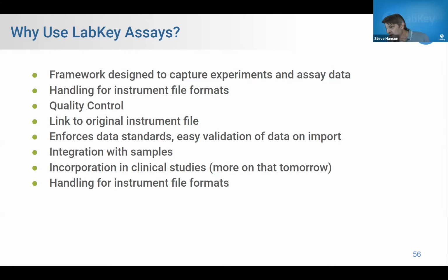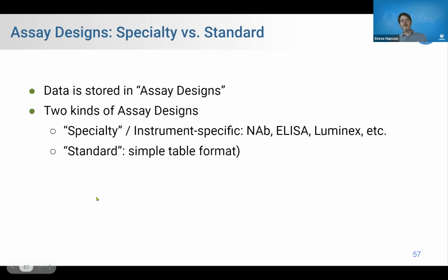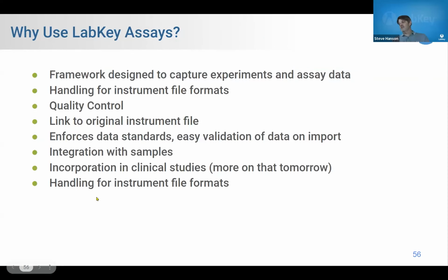Another question is, which audit log would you find changes to specific participant sample records, such as date of collection? There's a data sets part of the audit log that I'd look at. There's also a sample part of the audit log. I'll try to remember that. And when we actually look at samples today, I'll take a look at it again. And tomorrow we're going to look at data sets and clinical stuff. And that's another place I'll try to remember to go back there. Great. In any case, so back to assays.